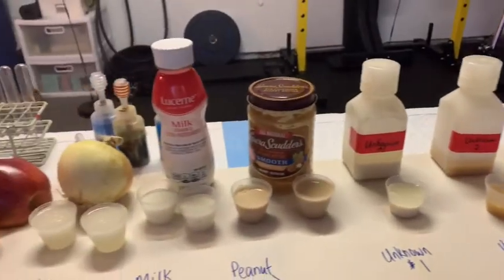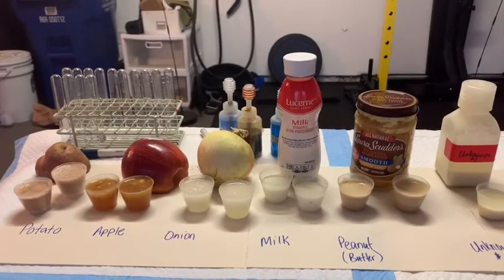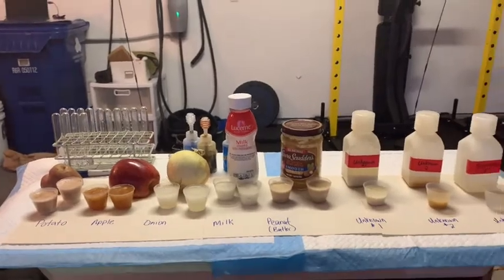We are going to take each of these and subject them to the biuret test, the Benedict's test, the iodine test for starch, and finally our fat test.